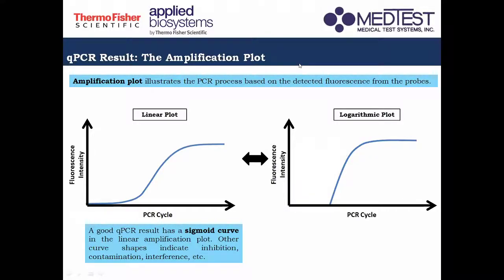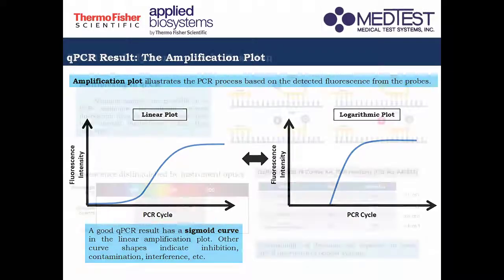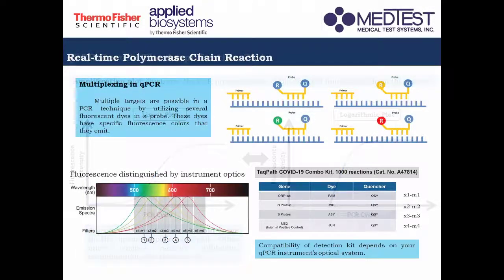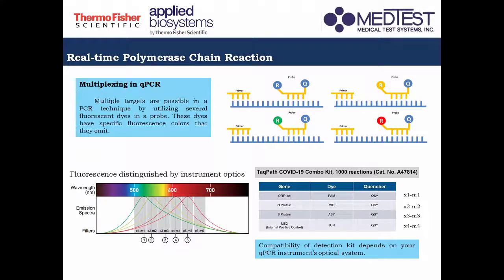Sige, bago po ako mag-proceed, because we will be proceeding with how to read the results of your qPCR. So before I proceed, may mga questions po ba?